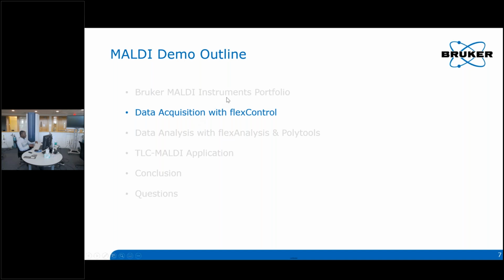So that was a short introduction on how MALDI MS works. Next, we're going to go into data acquisition and analysis. Again, just a quick reminder, make sure you adjust the different windows so that you can see the software that I'll be sharing and follow along as I analyze some of these samples.